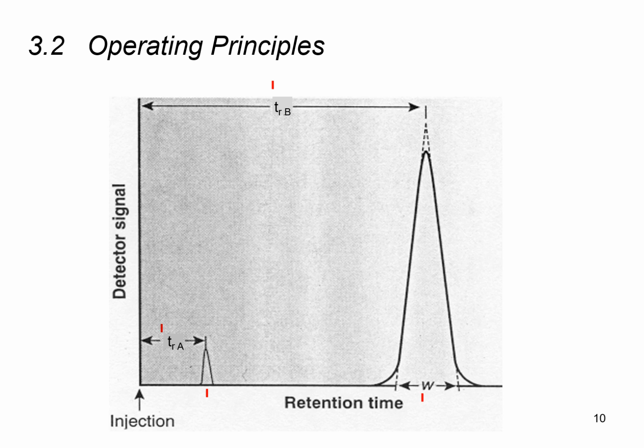So two important pieces of information we can get from the chromatogram would be the retention times of each of these chemical components, and also from the size of the peaks we can understand how much of each of the components are present.